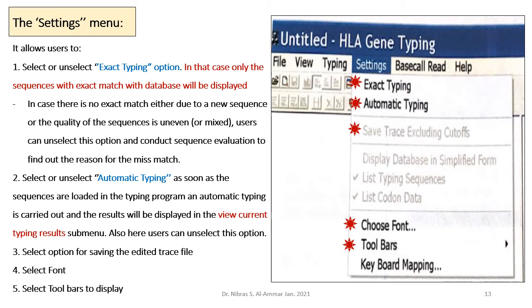Also, this setting menu allows user to select option for saving the edited trace file and select the font, select toolbars to display.